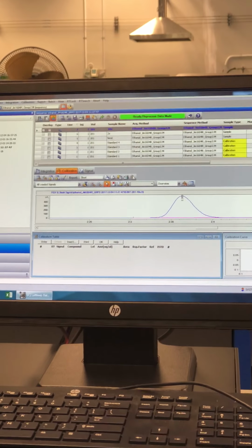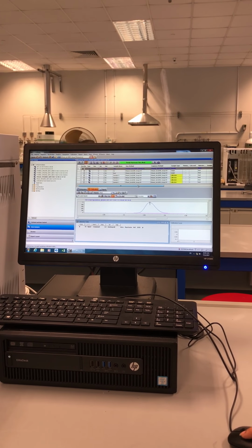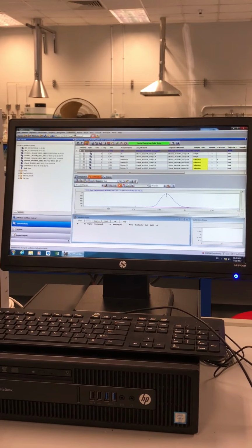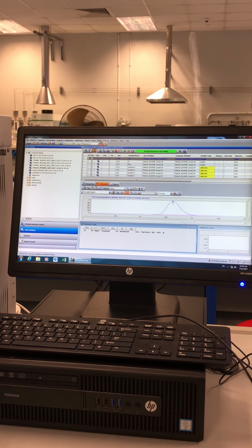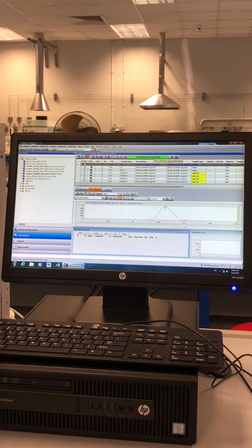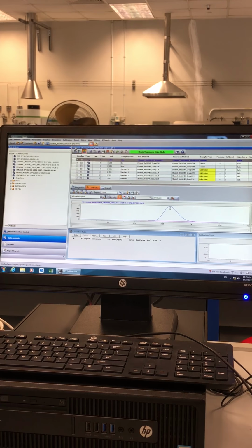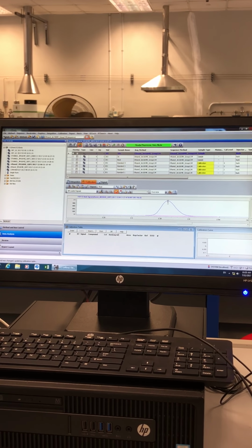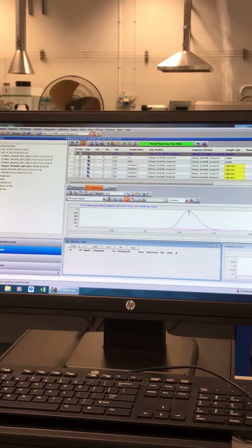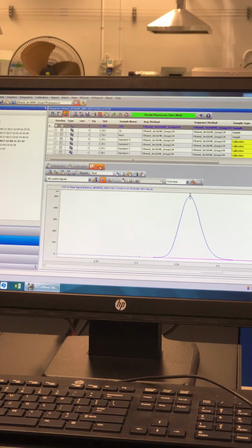After you've done that, the first step is to do an overlay. How do you do an overlay to determine the retention time? Go to the central display, the middle display. There's a word called signal. Press on the button signal, in the middle display of the screen. Integration, calibration, yeah.